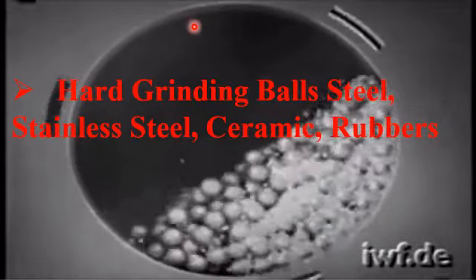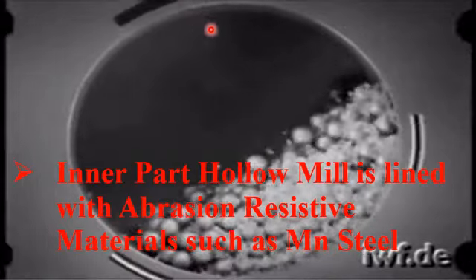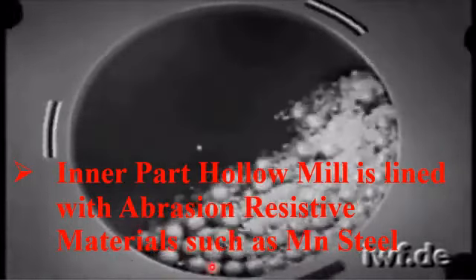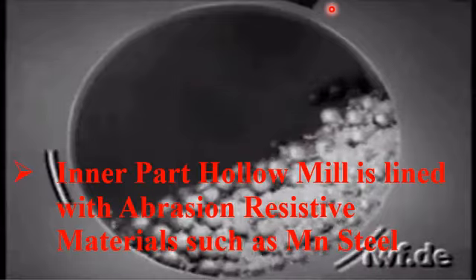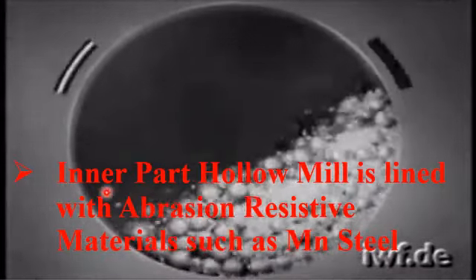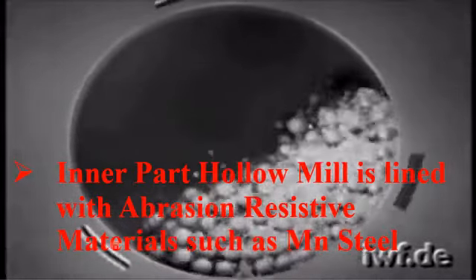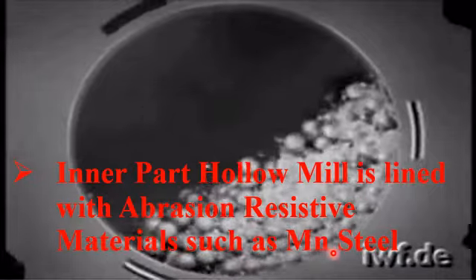Okay, the internal part of the ball milling apparatus is hollow, it is empty. The inner part of the hollow mill is lined with abrasion resisting materials such as manganese steel.